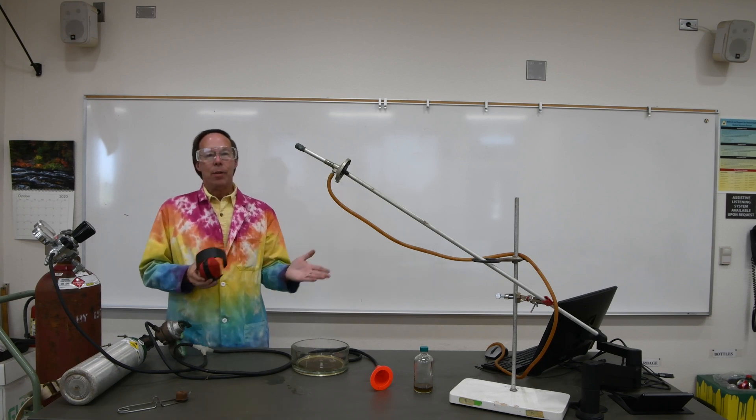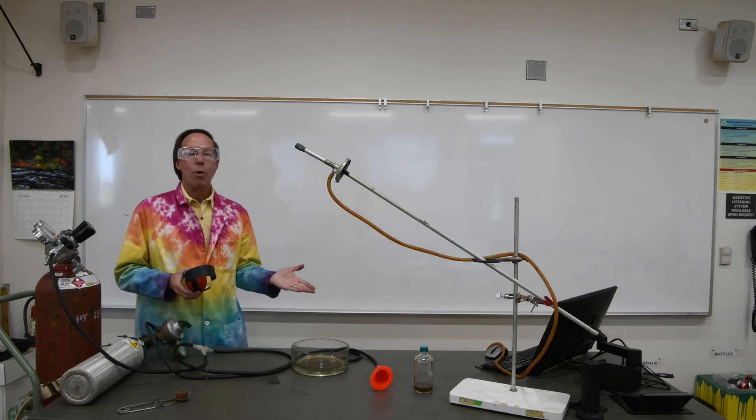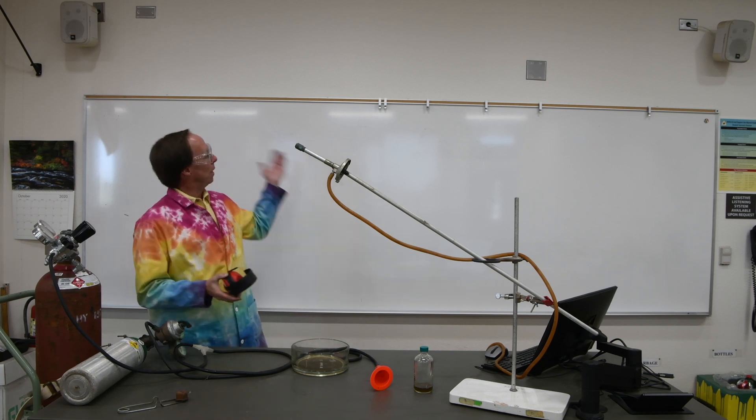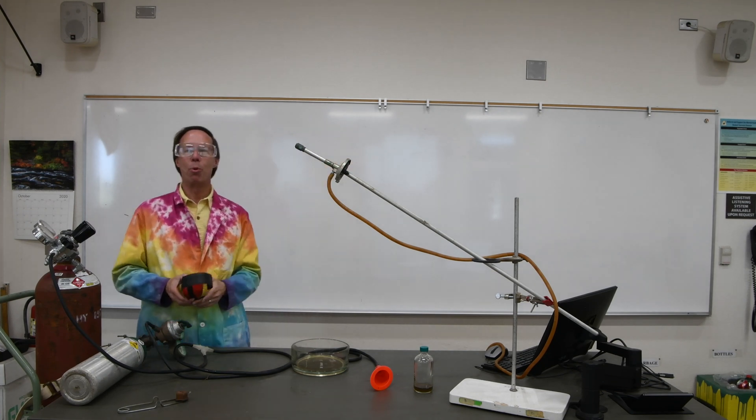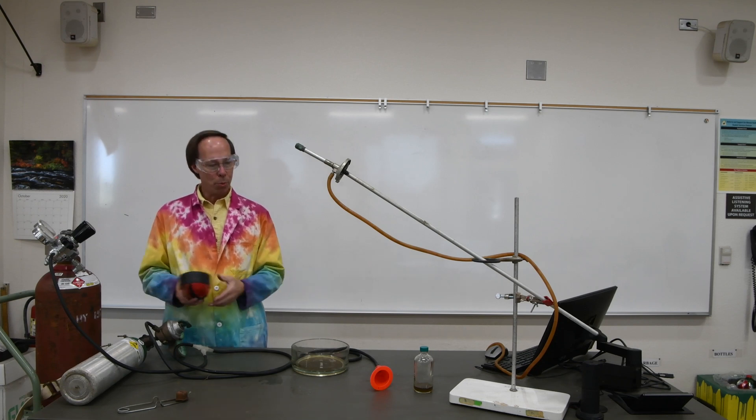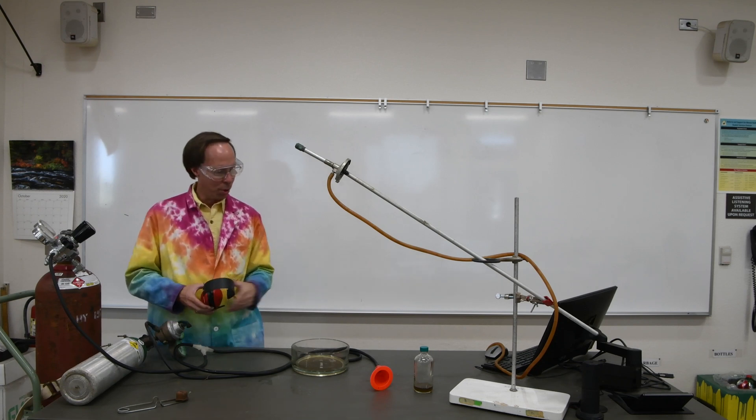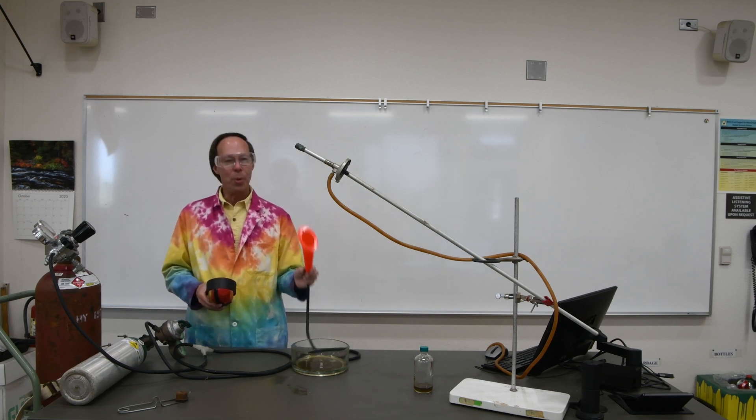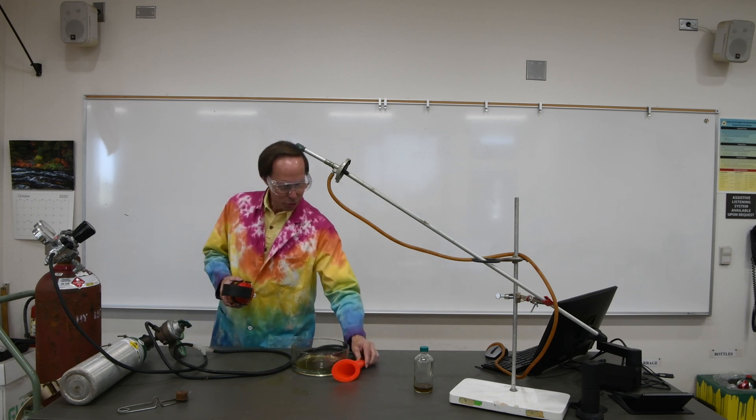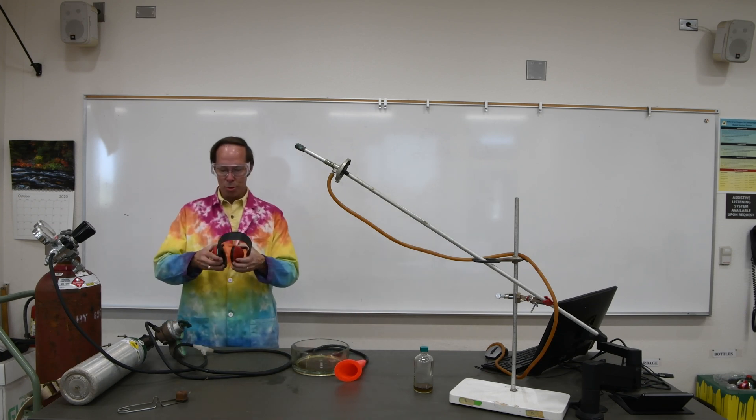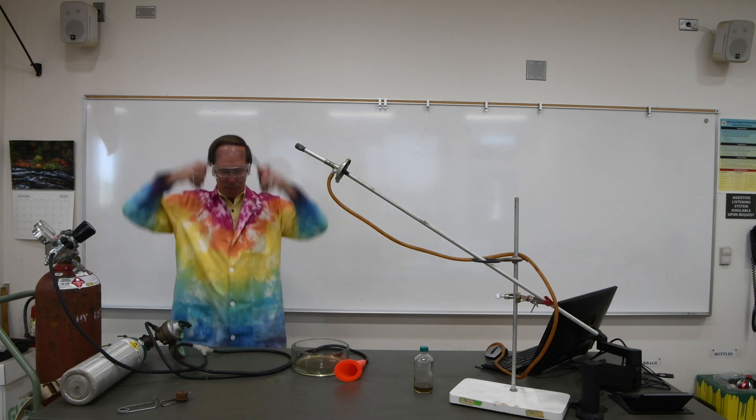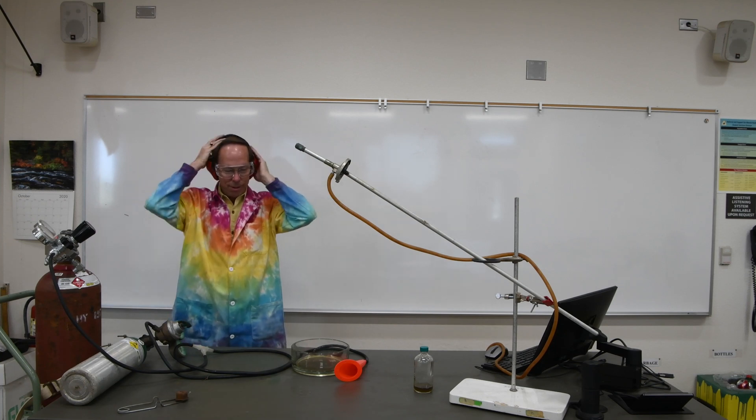So I'm going to be wearing this hearing protection just to be safe here. The ratio of the hydrogen and oxygen, you may remember from back in chapter 4, we had that nice big reaction up on the board. There was 2H2 plus 1O2. We want a two to one ratio. I'm going to try to estimate that ratio by looking at the size of the bubbles. Let's see how good a job I can do.